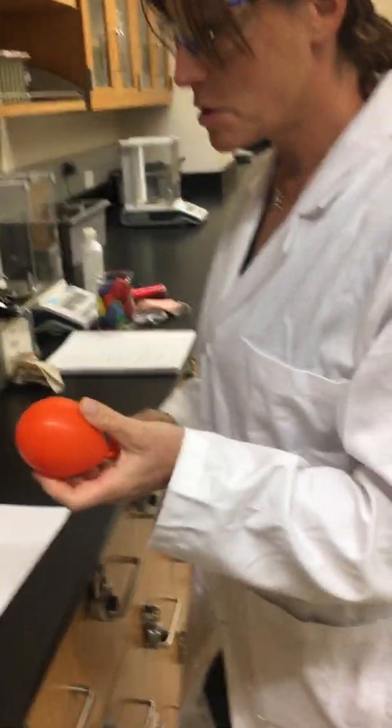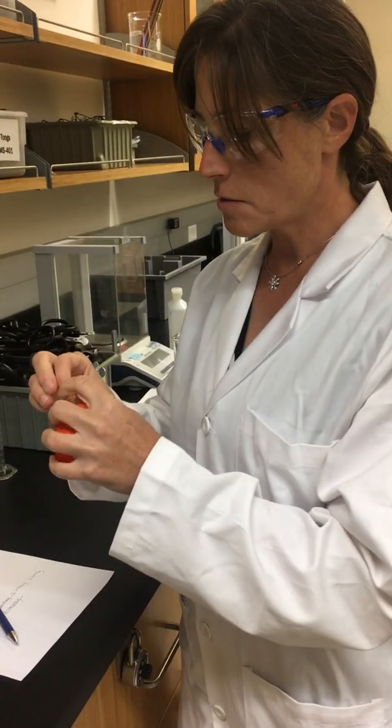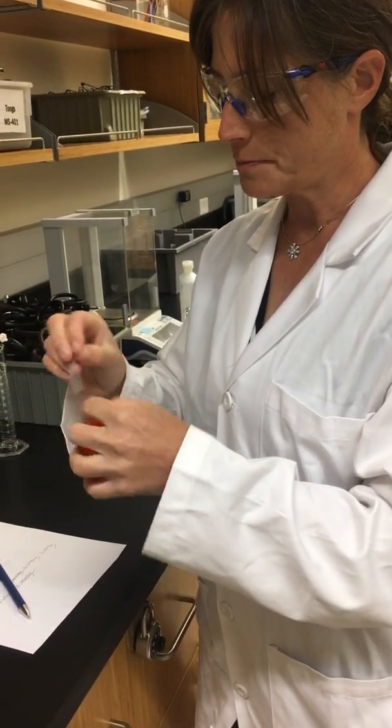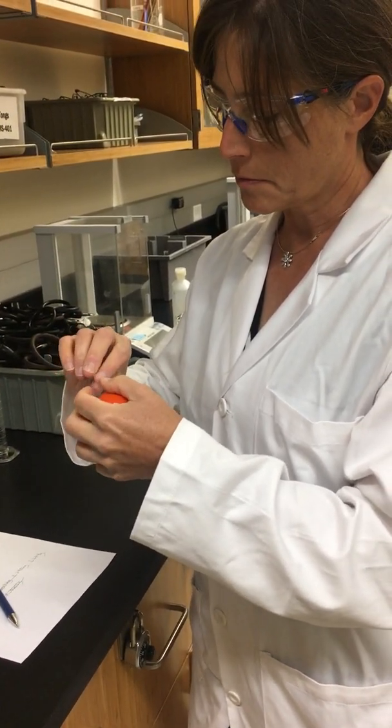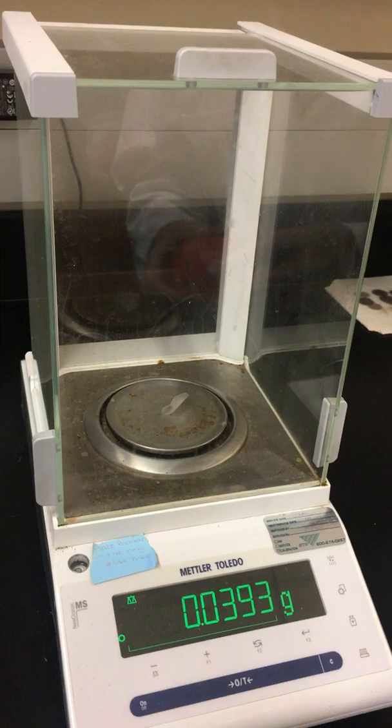So now we have our balloon sample with air in it. I'm going to use a piece of tape to help get this to adhere to the balance. We'll take the piece of tape and subtract out that weight so we don't throw off the mass of our air.